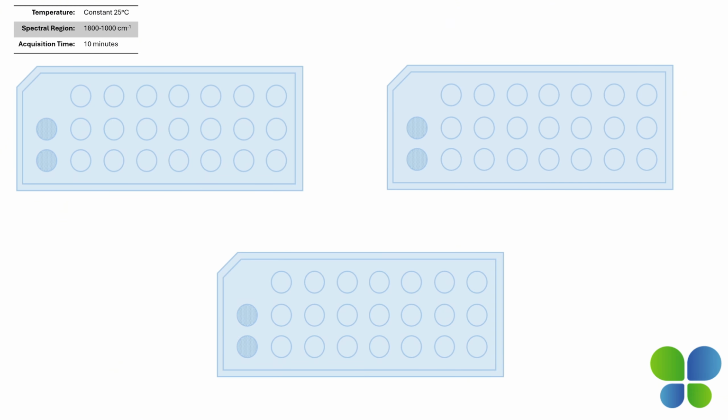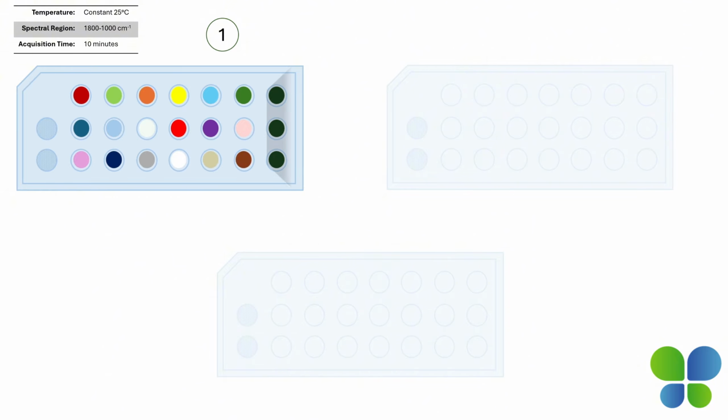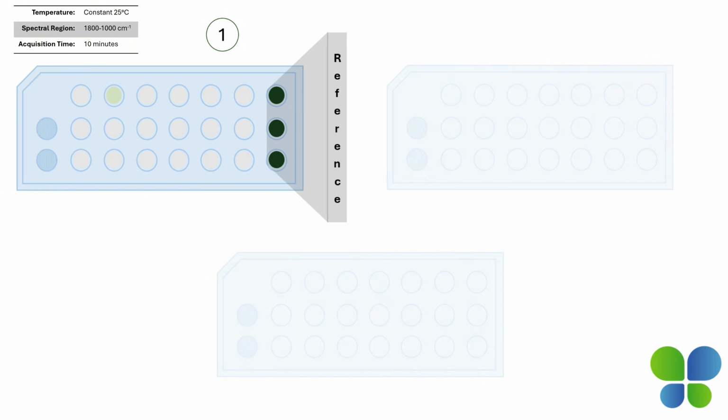The advantage of the flexibility of the slide cell array sample setup for developability assessment is the ability to define differences amongst an array of up to 21 lead clinical candidates to de-risk preclinical candidate selection. We can also evaluate the role of formulation conditions and excipients on the stability of the preclinical candidate.